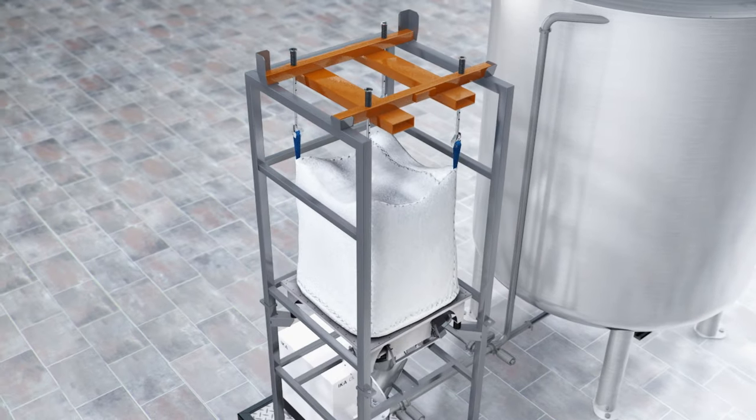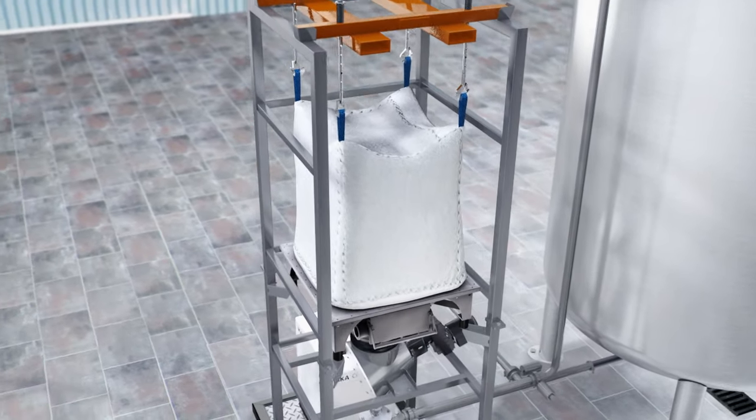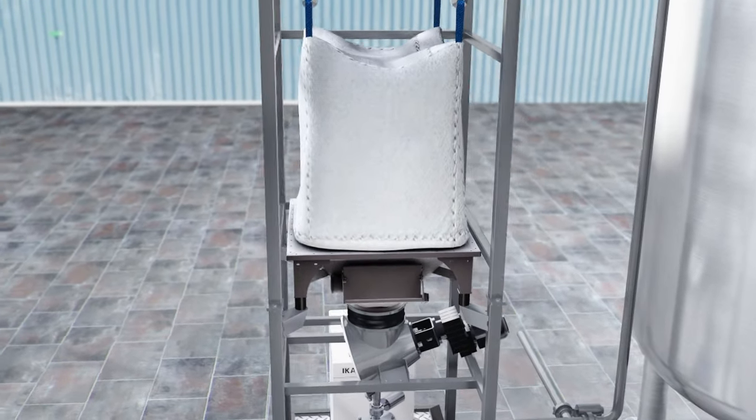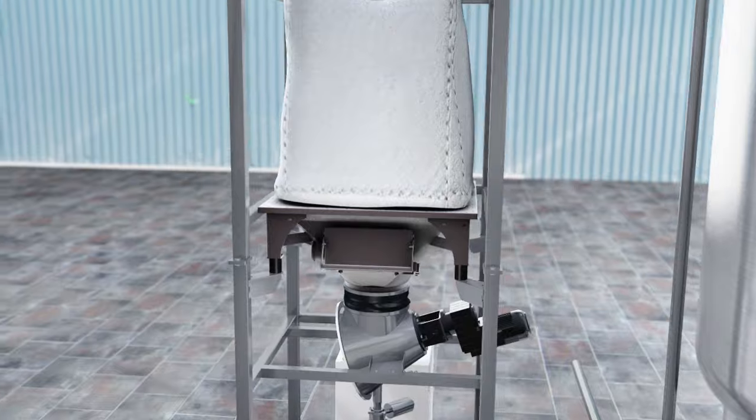The solids hopper, located above the CMX, is equipped with a bulk bag unloader. If the bulk material does not flow easily, a fluidization unit can be added.